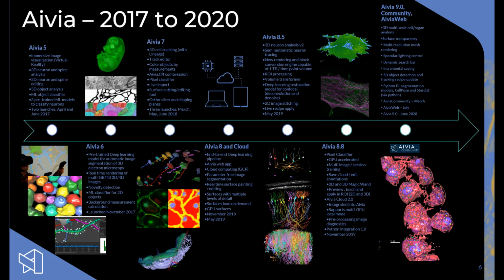It's hosted on our website and it'll include several of our deep learning models. Over the last 3.5 years, we have introduced quite a lot of new functionality, and we focused both on the AI microscopy side of things with tools for classification of objects, detection of objects, and also image restoration. But also a lot of image analysis functionality for neuron tracing, object detection, and virtual and VR image exploration, and much more. This is the full list.